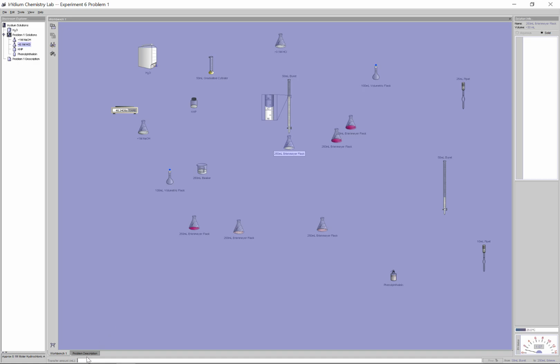We're going to transfer in, maybe it's safe just transferring in about 30 milliliters. Again, the first two gave me a rough amount, which would be safe. Let's pour in 30 milliliters. That pretty much empties out my burette here. Totally not pink yet. And again, now that I'm getting closer, maybe I'm going to add 0.5 at a time. So let's add in 0.5, transfer in 1.5, 2.5, right? So that's going to be 31.